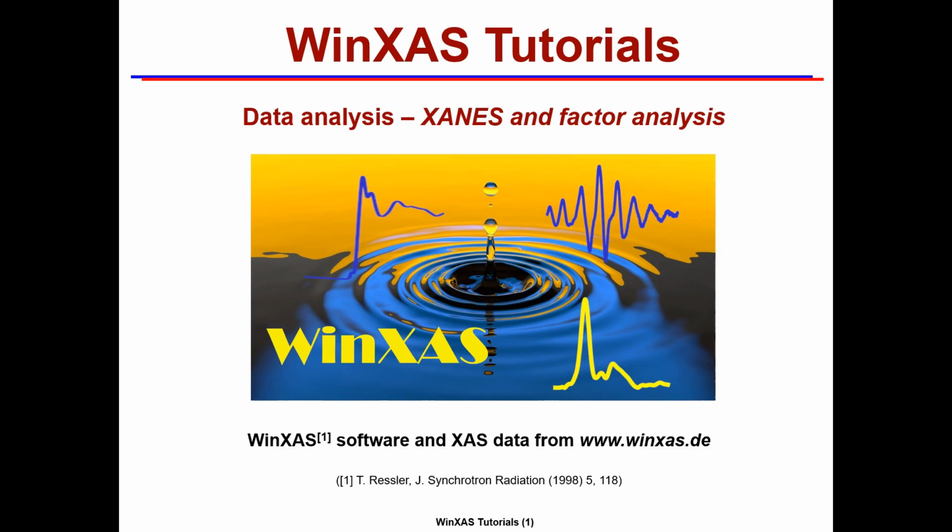Hello and welcome to WinXAS Tutorials, where I want to talk about XANES analysis again. This time we will be looking at the analysis of phase mixtures using reference spectra for fitting procedures and principal component or factor analysis. As always, the WinXAS software and the XANES data I will be using in a hands-on session can be obtained from the WinXAS website.